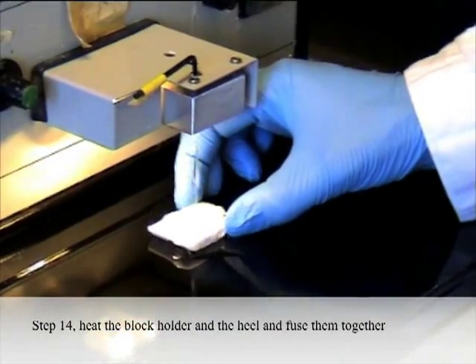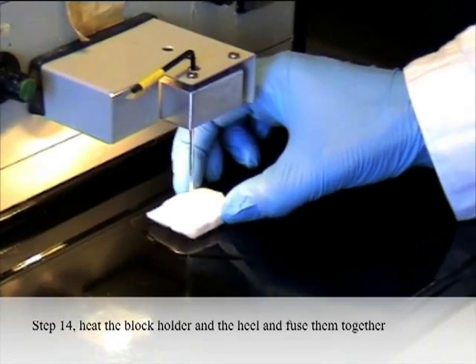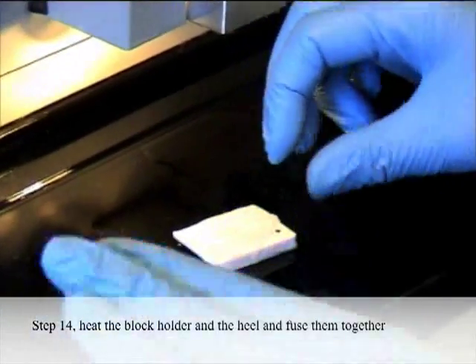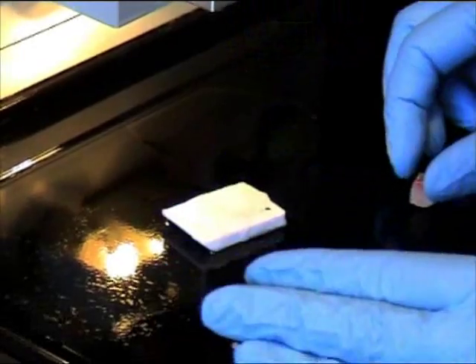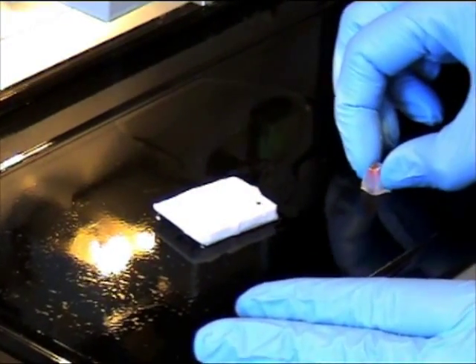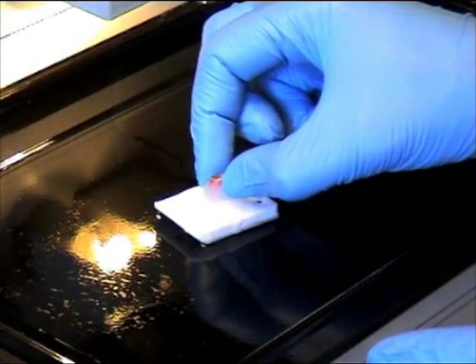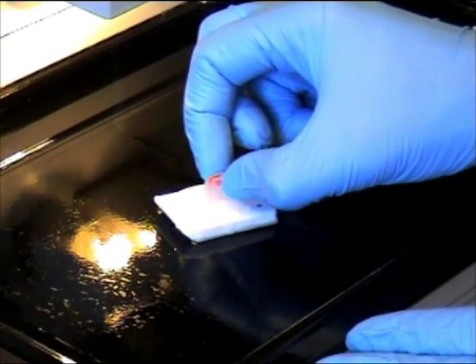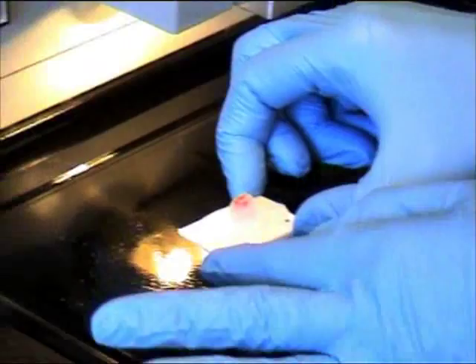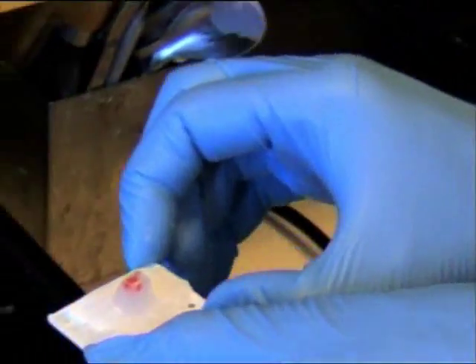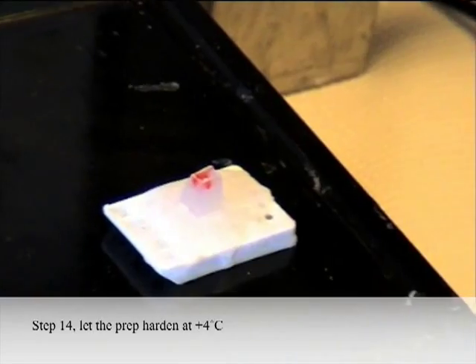Step 14: Heat the block holder and the heel and fuse them together. Let the prep harden at 4 degrees centigrade.